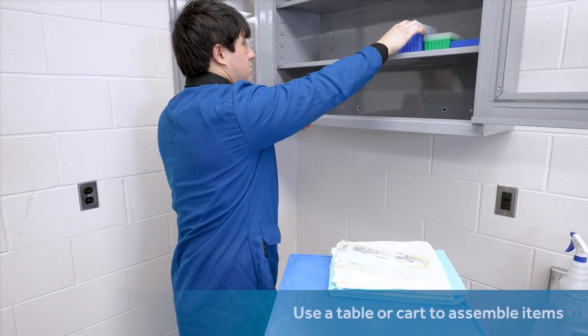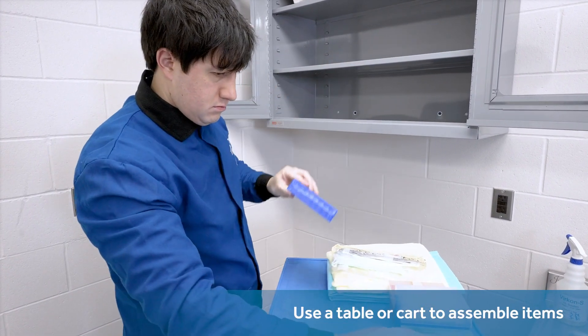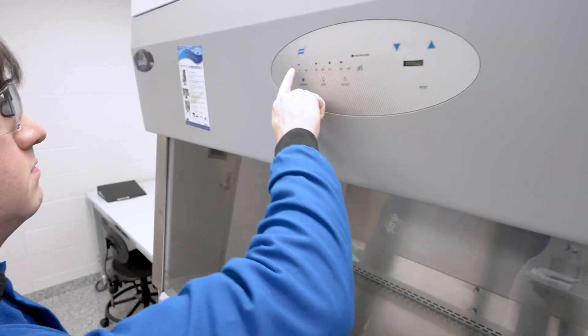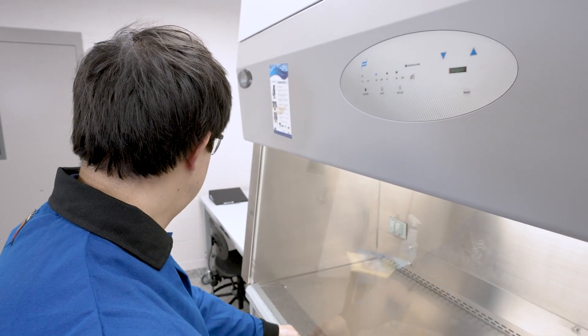Use a table or cart for assembling any items that are not hazardous. In a future step, you will utilize a gown and gloves to withdraw the hazardous items out of an incubator. Guidelines suggest you flush the cabinet with air using its own motor, usually recommending a time of 5 minutes.